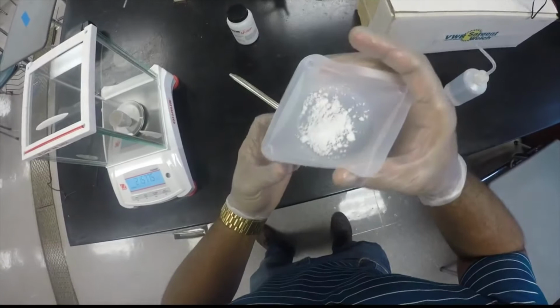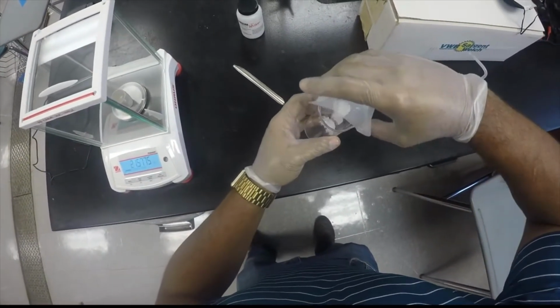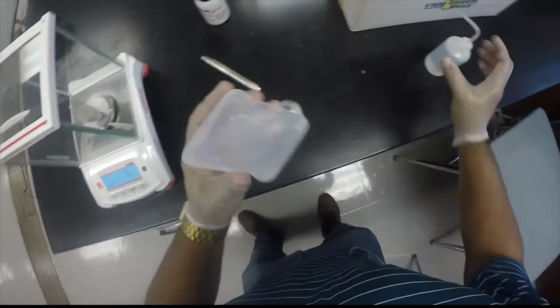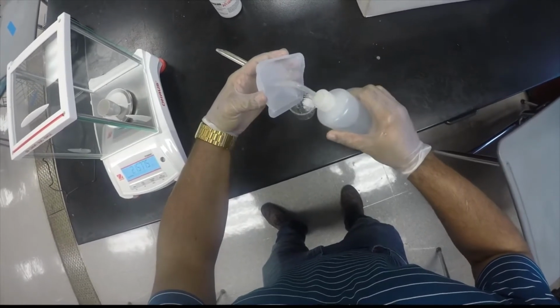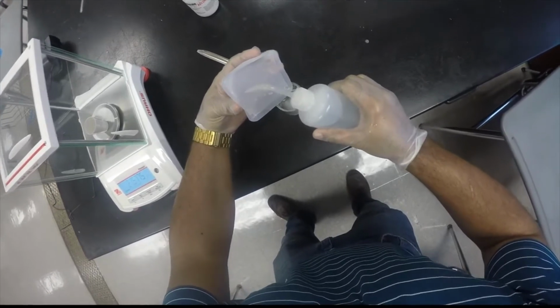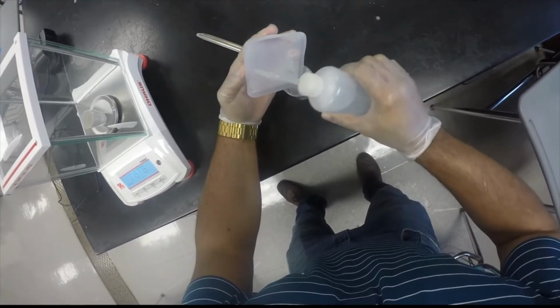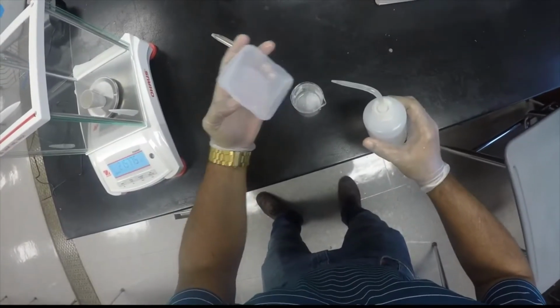Okay, so the next step is to dissolve the group 1 carbonate in a suitable amount of water. So I'm going to place the measured mass of the group 1 carbonate into a beaker. And I'm going to be careful to make sure I get all of it. You see there's still some residual there. I'm going to use a wash bottle to wash the remaining amount of my carbonate into the beaker. Okay, so I've done a reasonably good job of washing all of the remaining carbonate into the beaker.